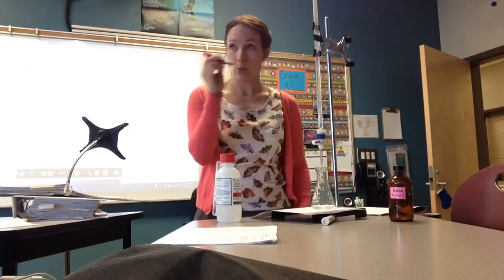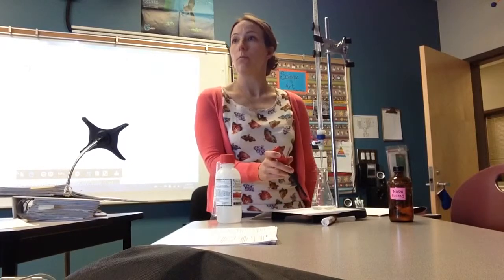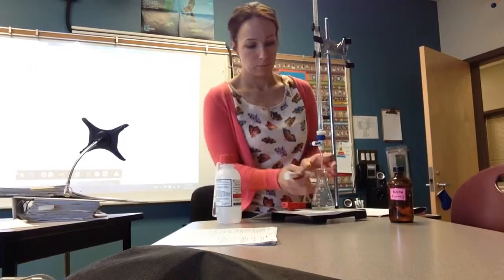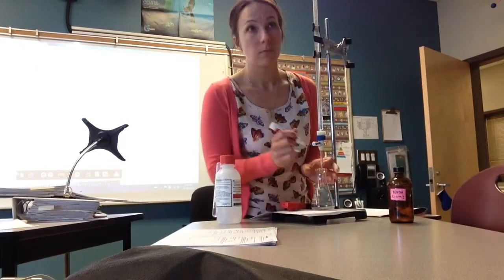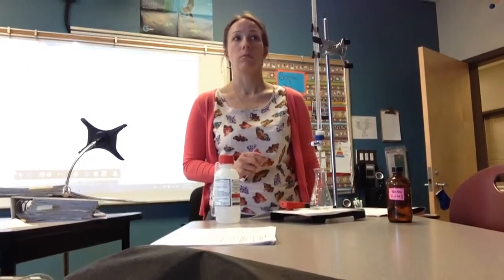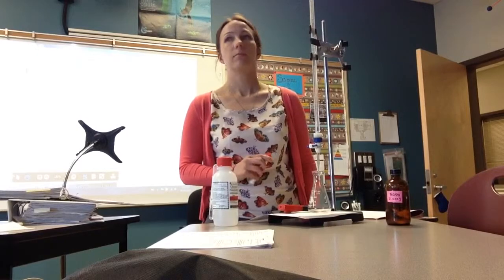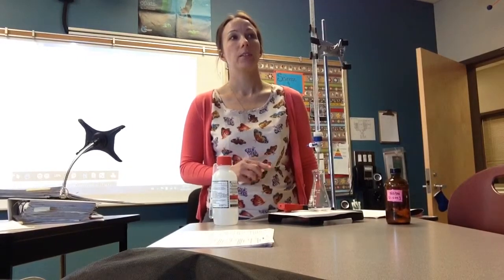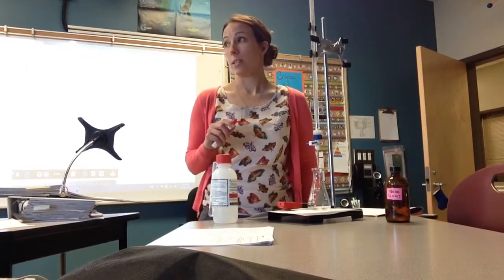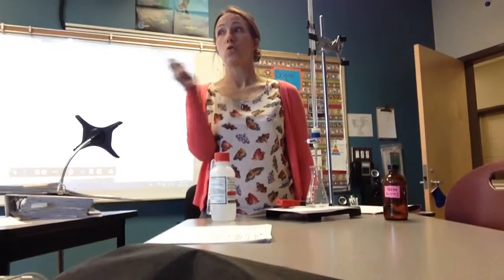Okay? If this were to work, and I were to stick this into my acid, my HCl acid, what pH would it be? Lower than 7. Less than 7. Can you be more specific? 1 to 4. Why 2? Because it's a strong acid. I don't even know why it's less than 7. Because it's an acid. Okay, so it's a strong acid.